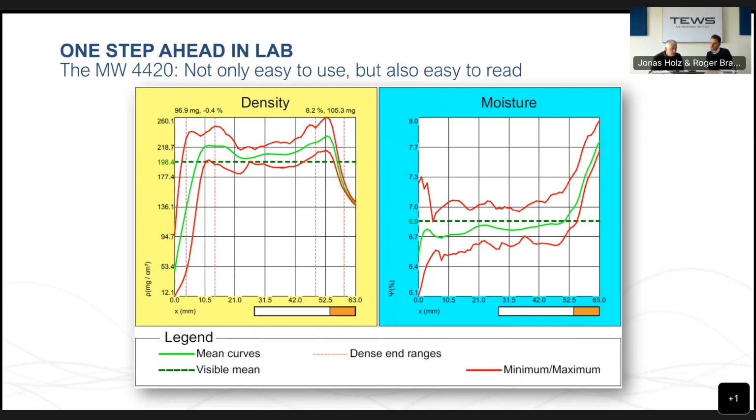So using the standard tobacco calibration for all products, for each kind of cigarette which you teach the instrument in the settings, you have individual offsets which you can set.